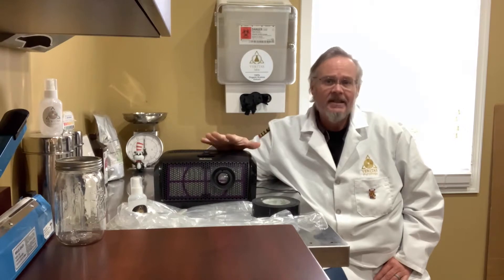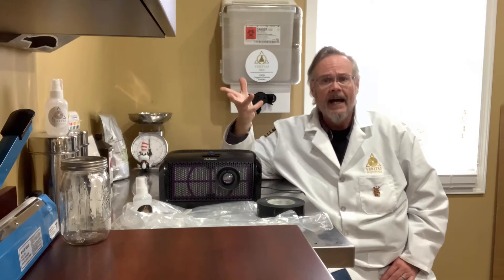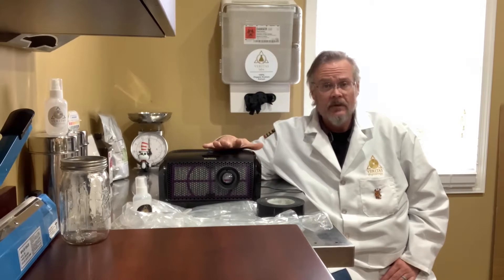This is precisely the same unit that I used to use in my home before I had a lab — when I used to use it for grain transfers, inoculations, culturing, etc. Anything I would use my flow hood for now, and I really never had any issues with this.